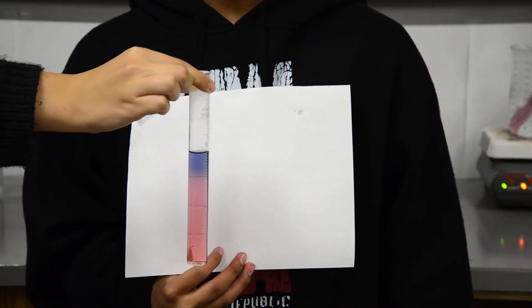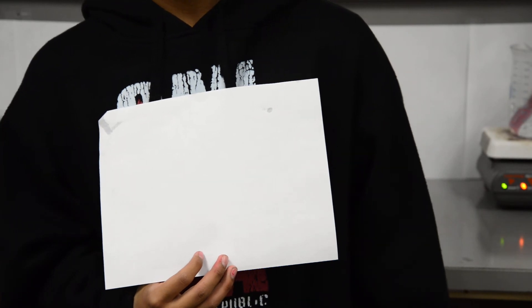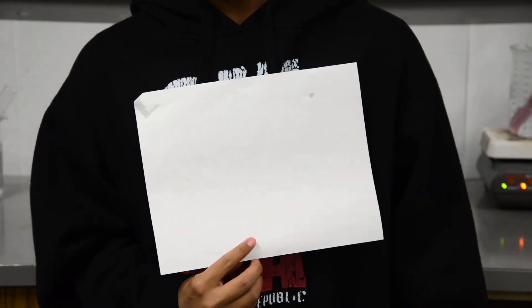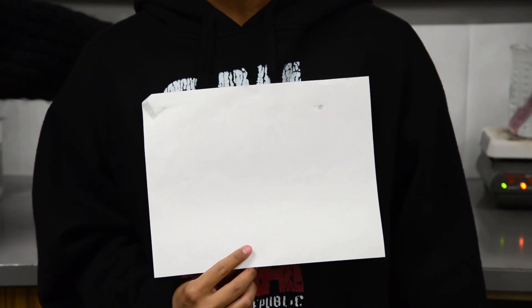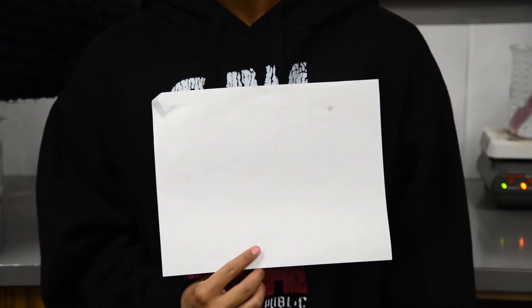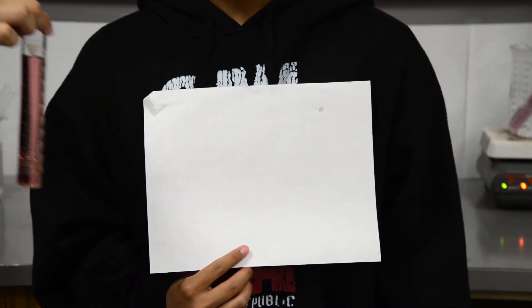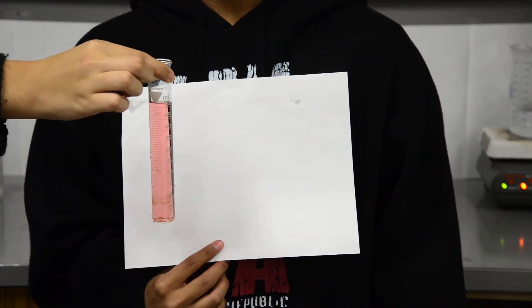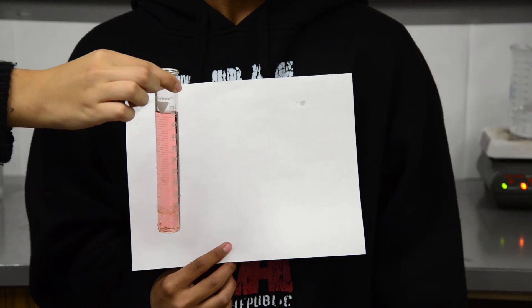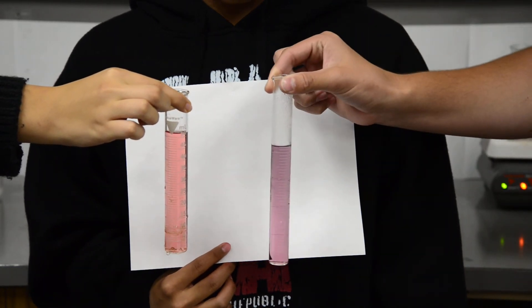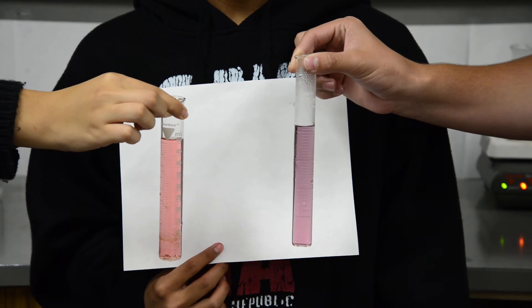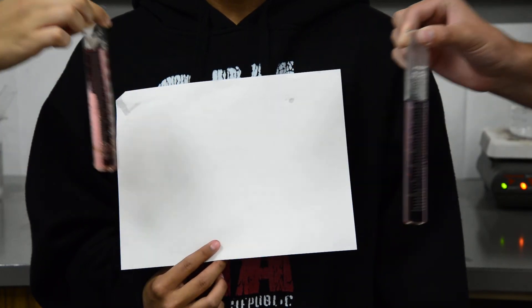Let's put that away now and back in the ice water. Let's take the room temperature one and put that out front. Now take the other tube and put it out front here. You can already see a big difference. The hot water takes a little longer to change. Let's put them back and let them cook a little longer.